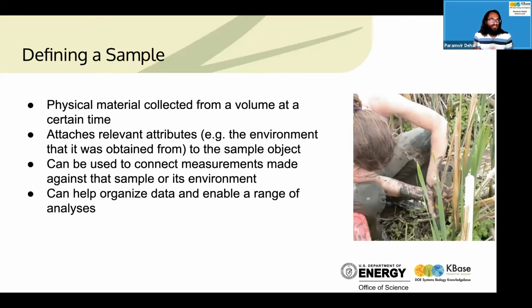And so now I'm going to hand it off to Shane Canon, and he's going to talk about how the actual implementation was carried out.